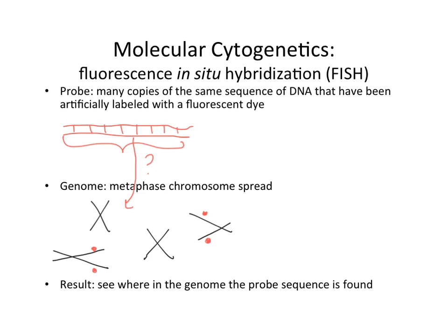Now if I switch to a different color probe, let's say we also have a different DNA sequence that we've fluorescently labeled blue, we can illustrate how this helps us solve some of our problems. For example, for the metacentric chromosomes, if that blue probe hybridizes to that metaphase chromosome there, and to this arm on this chromosome, now we know which arms of the chromosome are related to each other.